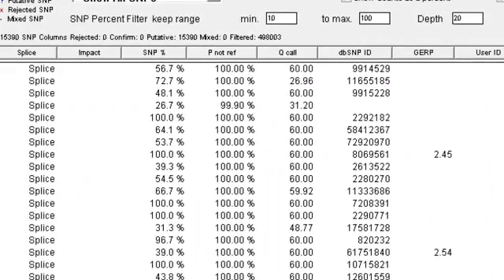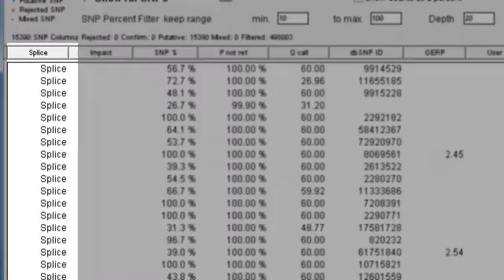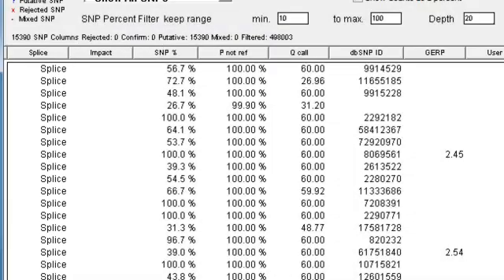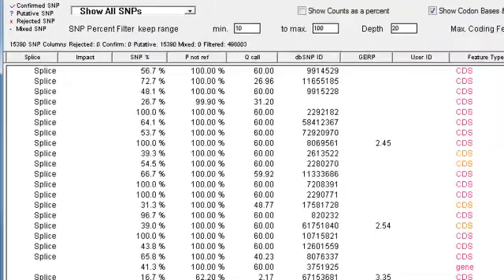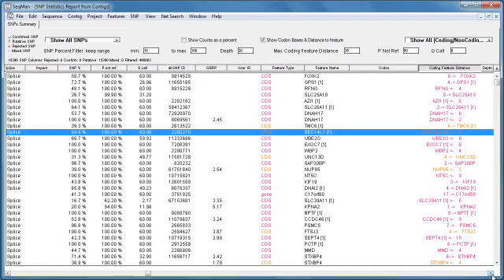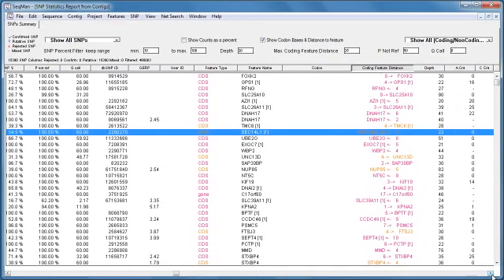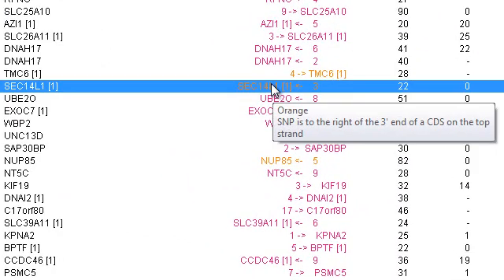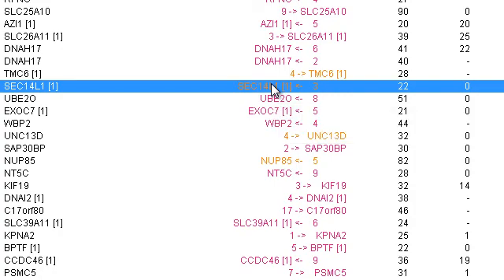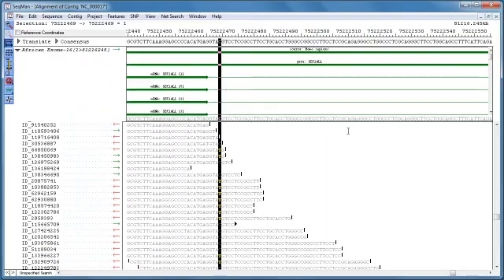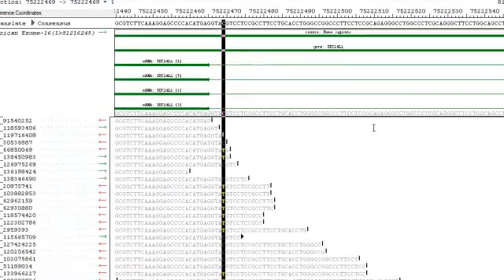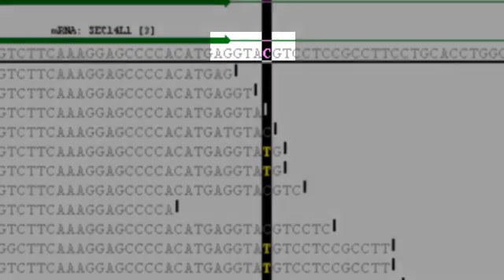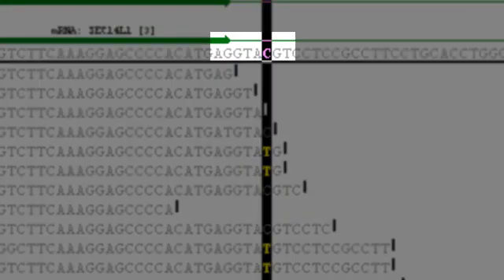Notice that many of these SNPs show splice in the new splice column, which indicates whether a SNP occurs in a splice site. This SNP, which is shown in orange, is three bases to the right of a coding sequence on the top strand. And if we look at this SNP in the alignment view, we can confirm that it is to the right of a CDS and located in the five prime splice site recognition sequence.